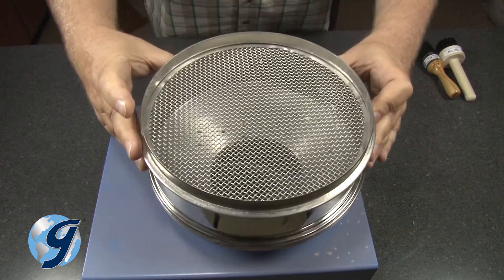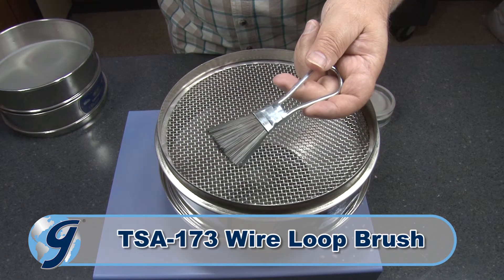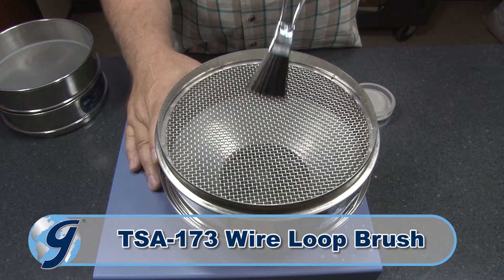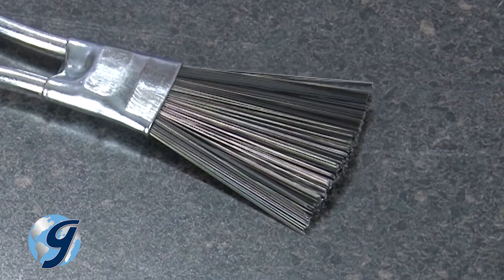Also, for coarse wire cloth within a test sieve, consider the TSA-173 wire loop brush with its one-and-a-quarter inch wide fan type brush and long metal bristles.